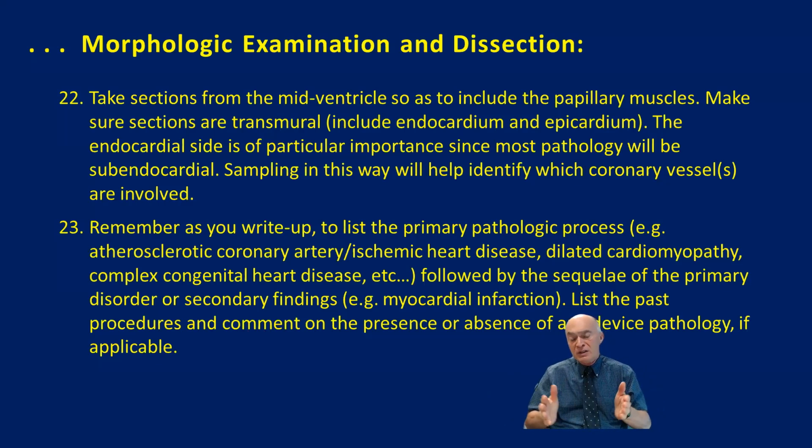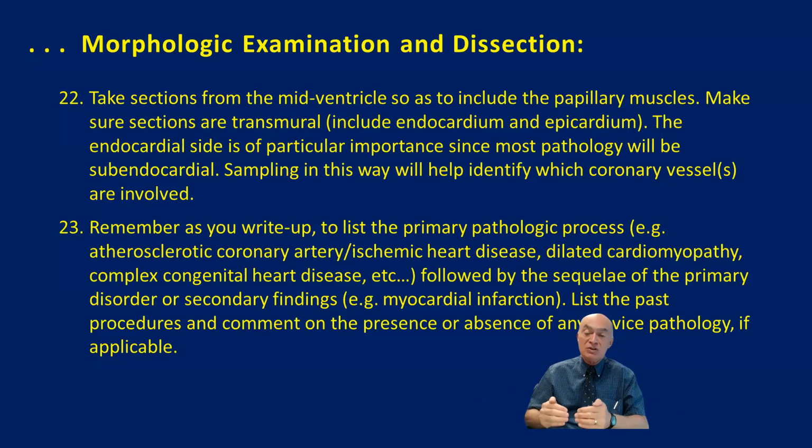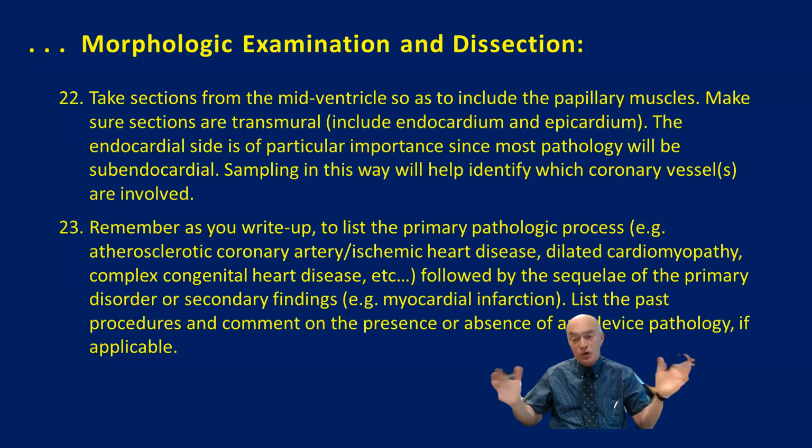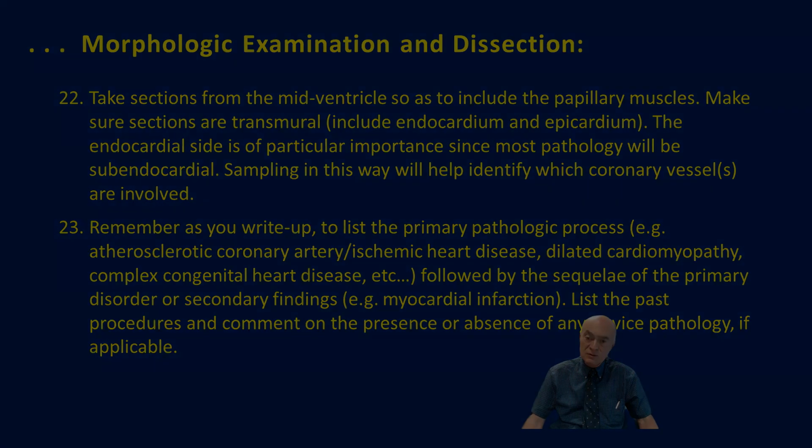So if the patient had myocardial damage, the most important thing, in addition to mentioning the damage, is what are the origins of that damage? In cases where there is a coronary artery disease, there is an obstruction, etc. So there is a kind of an algorithm in reverse in the way that you have to describe these lesions.